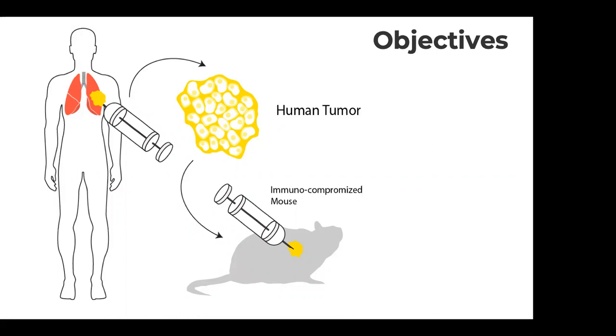As a result, we have two different assemblies, one from the human, one from the mice. Two different assemblies and annotated genomes to map the RNA reads. So we have to use a genome assembly which has both human genes and mice genes as well. So this will be our data set.